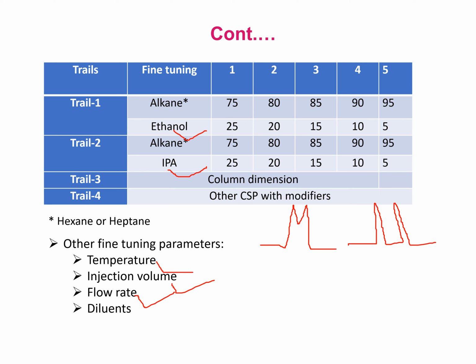Definitely separation will take place. If required, column dimension can be increased. A column with lower particle size can also be tried.